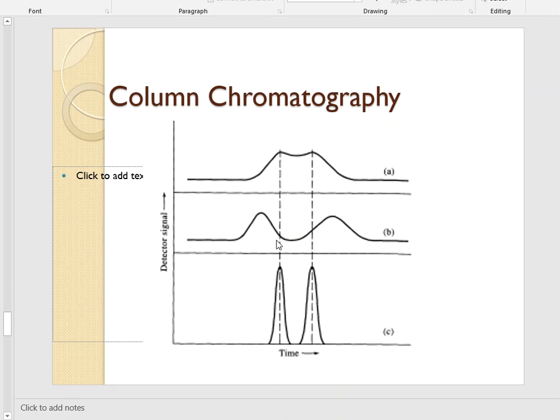So then we go to C, and C I think no one would argue with, and C would basically say these two peaks are separated, there's no questions about it. This is a very clean peak that goes straight up, straight down, and clearly it goes to baseline. And then the second peak goes straight up, straight down, and clearly that goes to baseline. So I think that C, everyone would agree that those two peaks are separated.